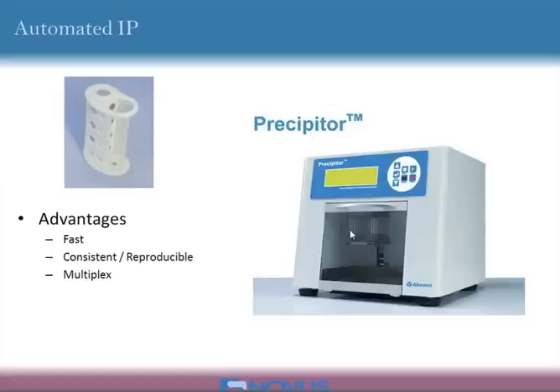So what's happening is these magnetic rods come down and can be turned on, bind your magnetic beads, move them over to the next well, and then wash them. You can also control the stringency of the washing with the machines, much more so than with a shaker or rocker. You can have these come down either very slow and use a speed like this, or they can go very, very, very fast and have very stringent washing. You're also reducing contamination.